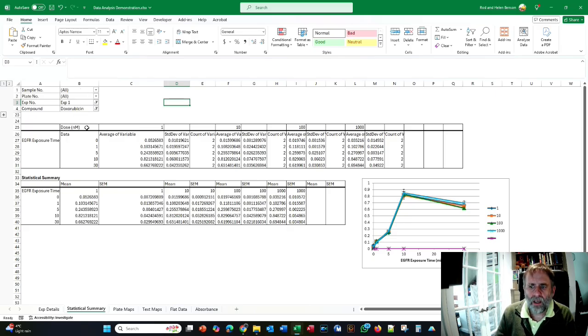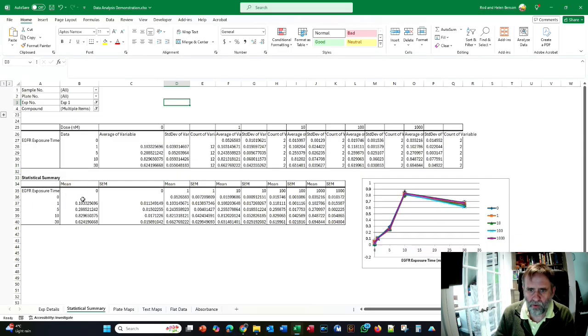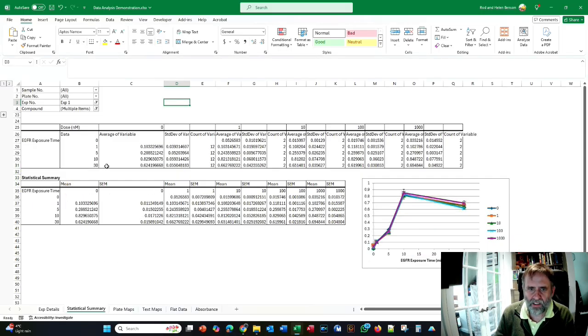That's fine. But interestingly enough, you can see that we're starting at 1 nanomolar. We don't have our 0 dose in there, because to get the 0 dose, we would also need to include it by including DMSO. So really behind the scenes, what we want is this plot where we have the 0 dose as well for each individual experiment. Okay, so we really want this. We want to hold the DMSO while moving through each individual experiment.